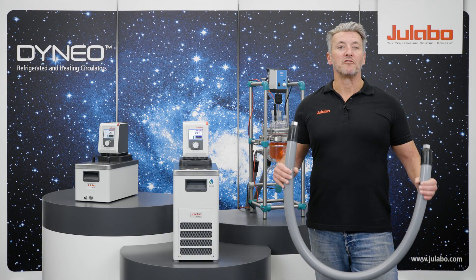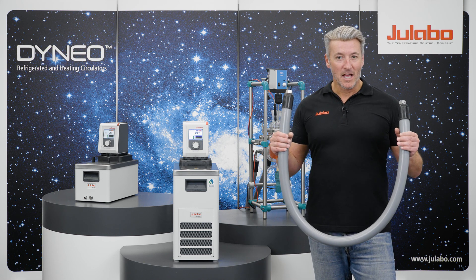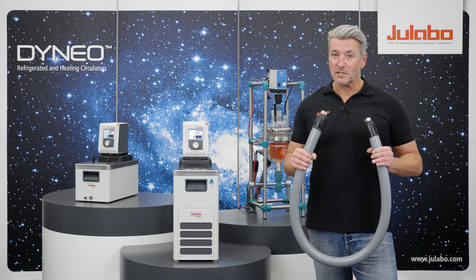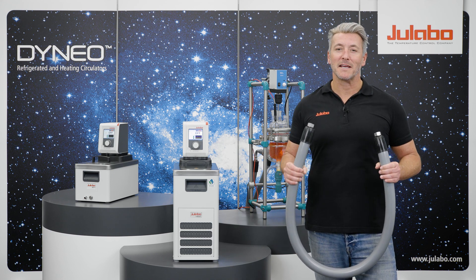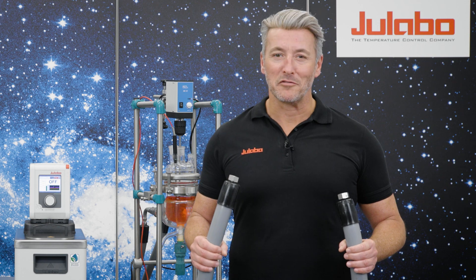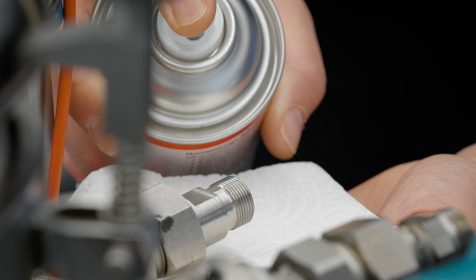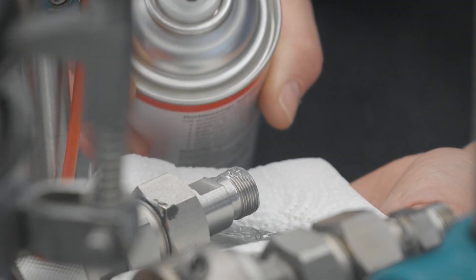To ensure the best system performance, we offer special insulated tubing in various lengths. Please make sure not to bend the tubing too much and always keep the specified bending radius in mind. For a more convenient connection we also offer different elbow fittings. Pro tip: for really smooth connections you can additionally use an anti-seize spray or paste.